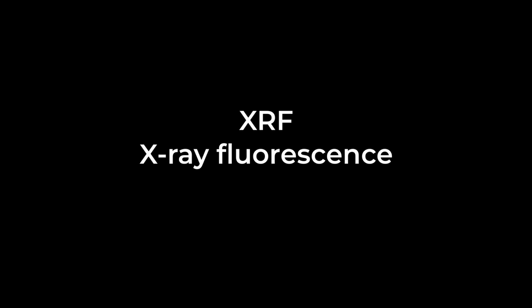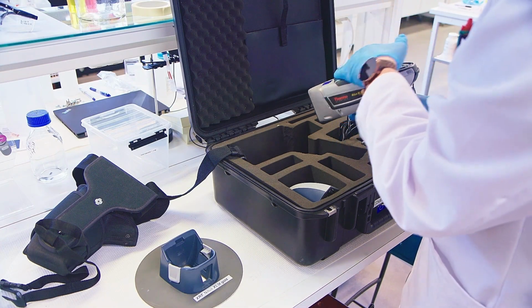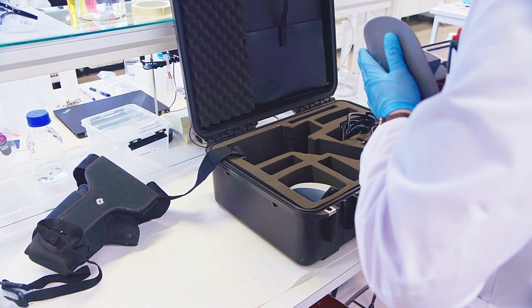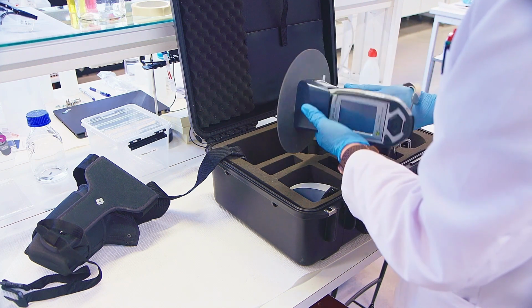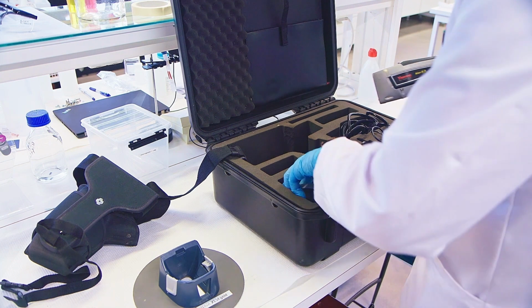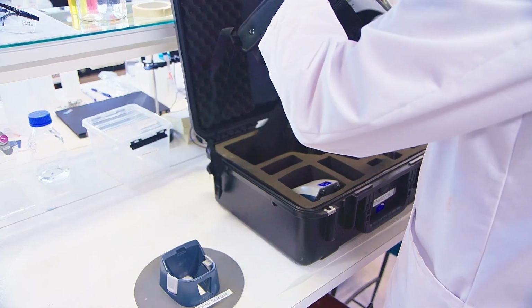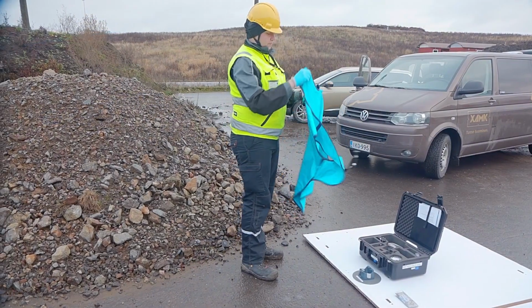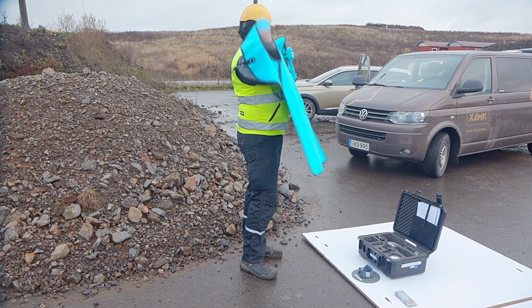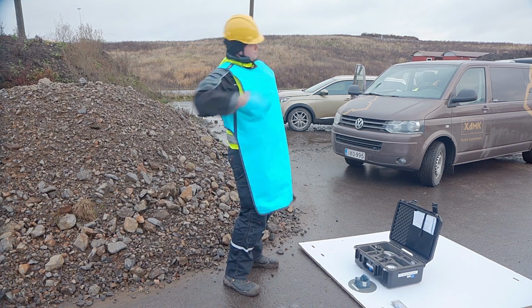X-ray fluorescence, or XRF, is a non-destructive analytical technique used to determine the chemical composition or metal content of materials such as soil samples. The heavier the element, the more reliable the results of the device. The device is therefore well suited for heavy metal analysis. Since the device emits X-rays, the user must be trained and qualified to use the device. Wearing a lead shield while taking measurements is particularly important. The X-rays also pass through the measurement platform, so the measurer's legs and feet should not be below the sample, such as under the table.